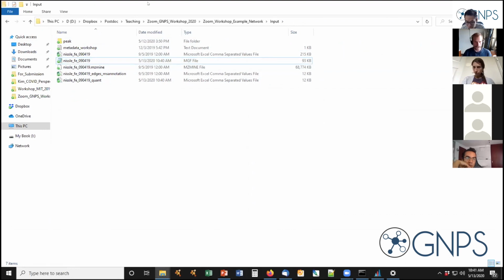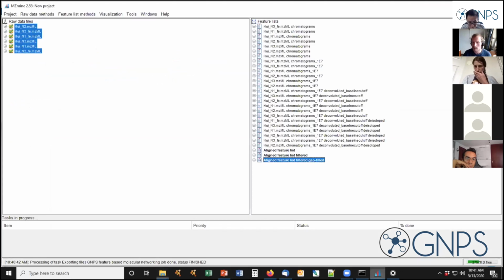If you did not make it till there, that's not a problem at all, because in the massive dataset we're going to share with you, all those files are already pre-processed for you. So we can basically just start from there tomorrow.